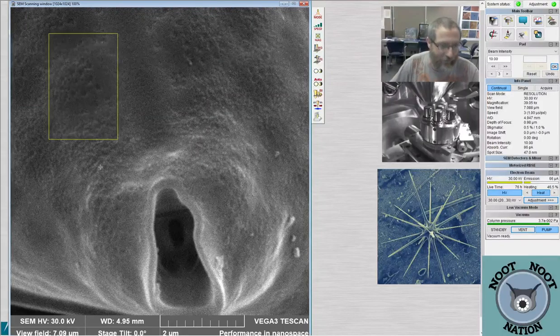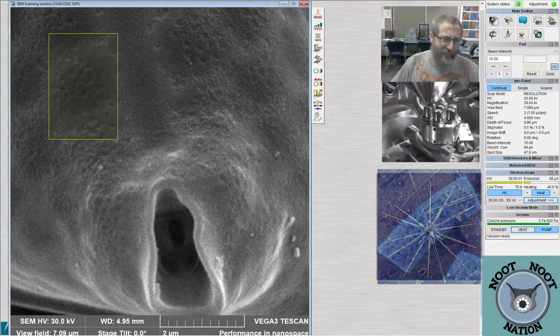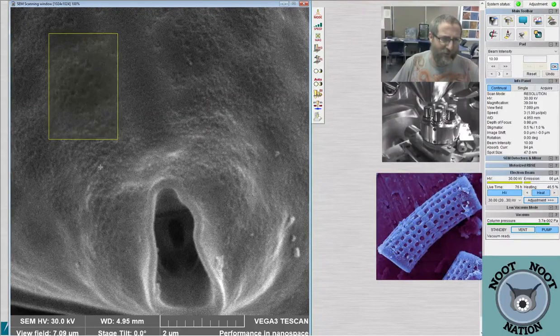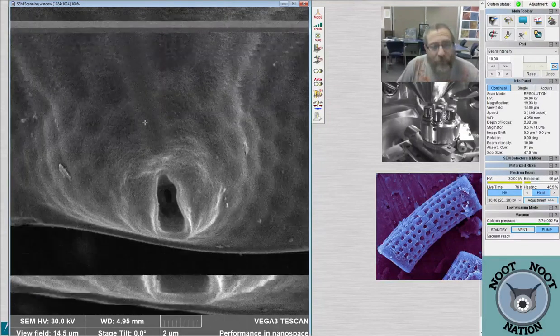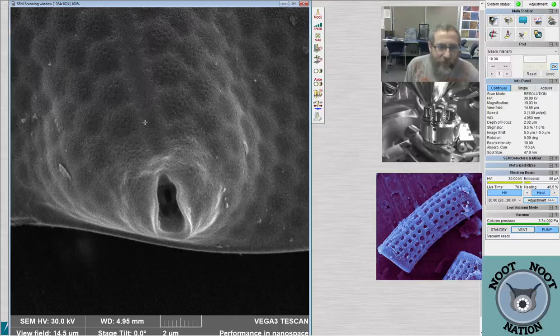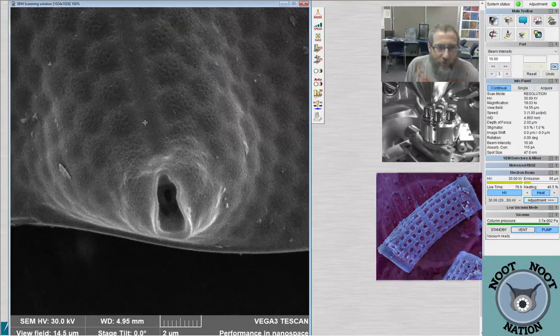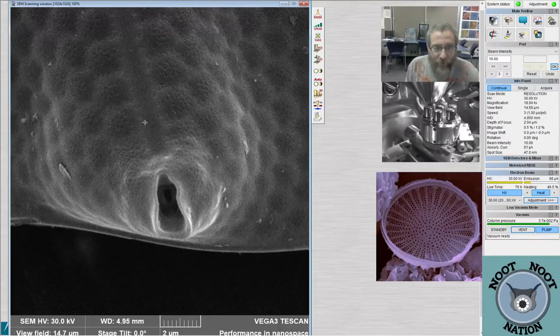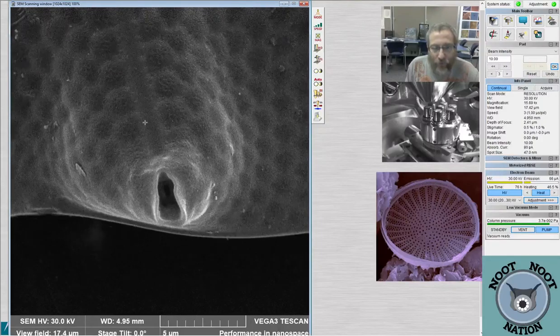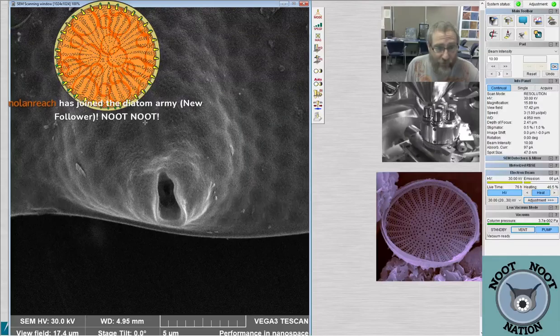Not that that's any better. Right. And then Zenbor wanted to know, can't you stack images? In relation to what you were saying, in a camera, it's relatively easy to take pictures at different focal heights and stack them, and that only helps with one aspect, which is basically the depth of focus.